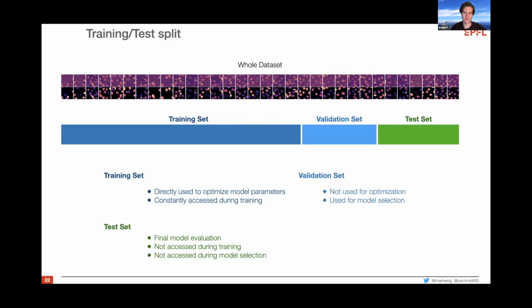And there's an additional detail: even the normal training set, you split again into a proper training set and a validation set. And the validation set is used during model training to evaluate the model. It's not used for training itself, but each epoch, so each subset of runs of the model, it constantly checks its performance on a holdout validation set, which is a subset of the training set. And it's only used to check when you should stop training, when your training is enough, when you actually overfit. Overfit means that your network is getting too good on the training set, and it's losing performance on the test set.